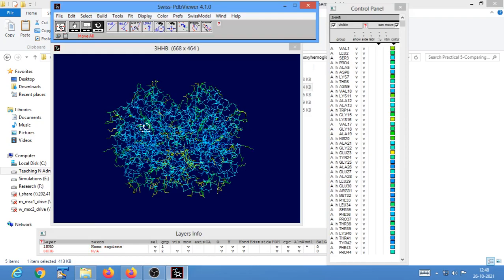So what does this indicate? With menu commands, the Shift button extends whatever action you have taken to all the layers. For any key to have an effect on the menu command, you must press the key before pulling down any of the menus.